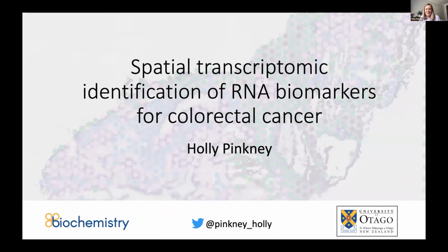That's okay. Cool. Okay. So I'm Holly. I'm in the DMI lab at the Department of Biochemistry at Otago, and I'm using Visium to identify biomarkers for colorectal cancer. Before I begin, I have a small disclosure that my project does have some commercial interest. So for IP reasons, I can't go into specific details about some of the biomarkers that I'm identifying, but I can walk you through what I've done and how I found my experience using the Visium technology. So I hope you enjoy.